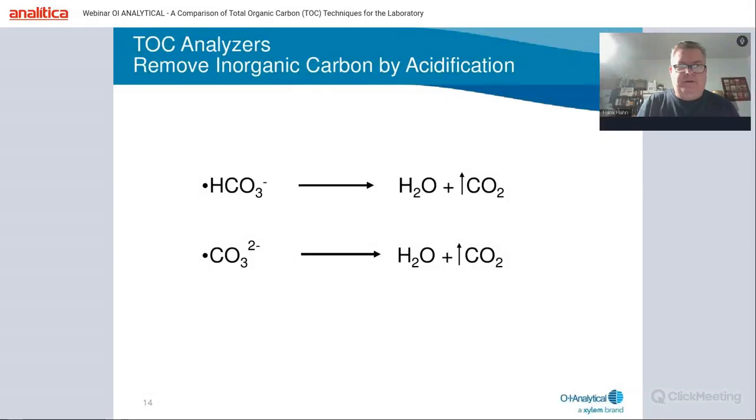What we do is remove the inorganic carbon by acidification. For removal of the TIC, the acidification is required, and there are no exceptions to that. So, for instance, as I mentioned, with wet oxidation we use phosphoric acid. In combustion, you use hydrochloric acid with our instruments.